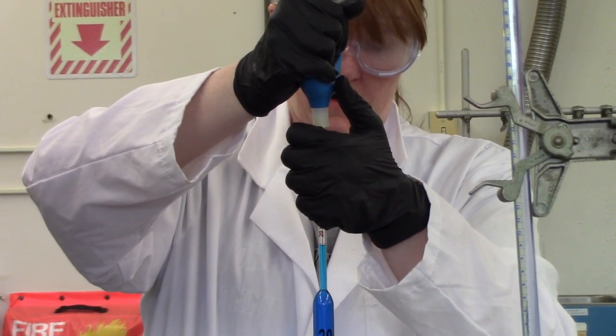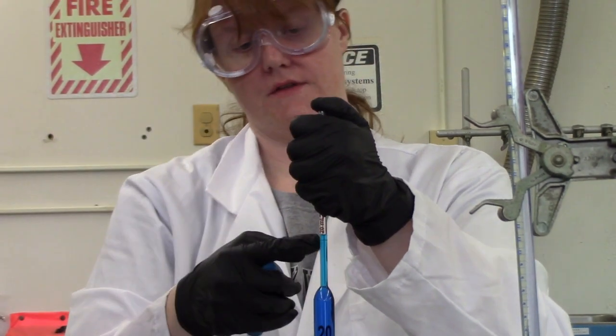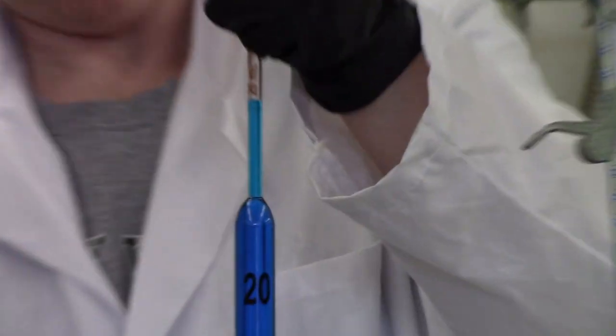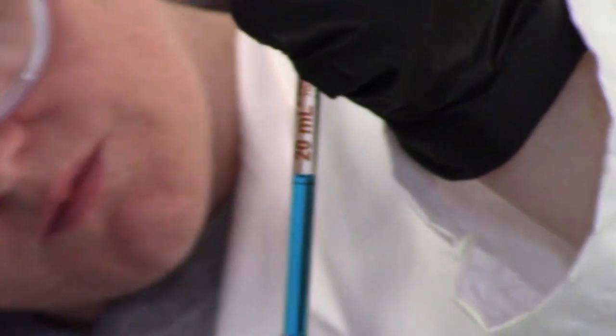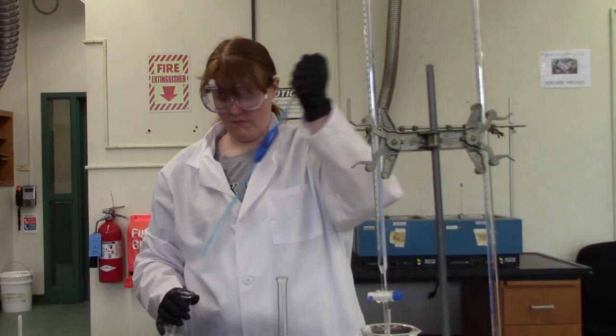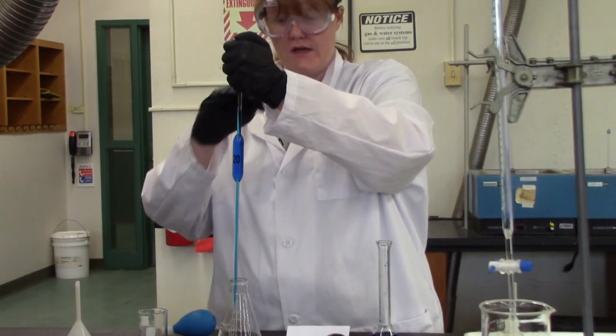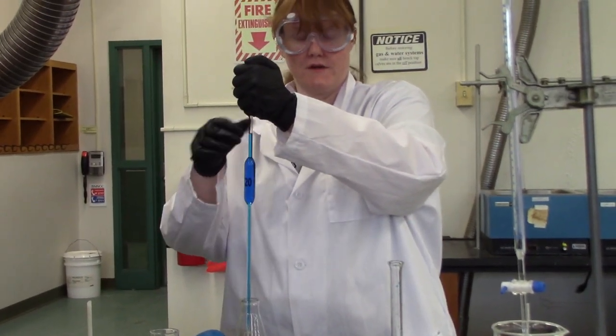What I'm looking for is the blue just above this brown line here. Well, it's a circle, really, but you want to bend down so it looks like a line. And then you release the volume until it gets to the solid line here. You want your meniscus to touch it just perfectly.